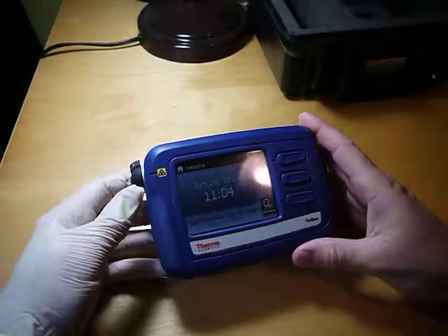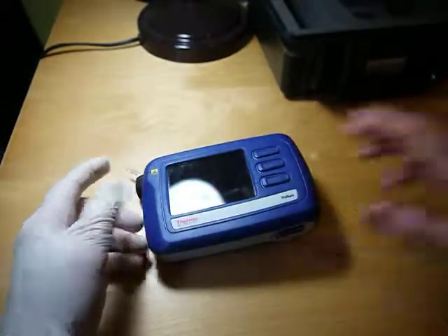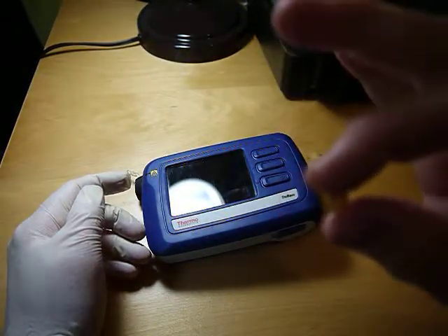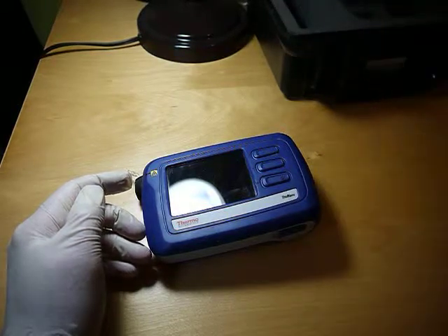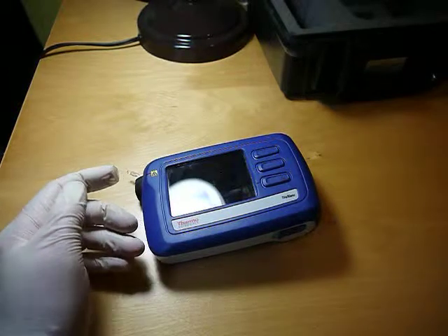I want to do some testing with the TrueNARC. I've already done my daily check. I was going through my medicine cabinet and I found some prescription — it's a prescription that I had a couple years ago for cyclobenzaprine. I don't even remember why I had it.